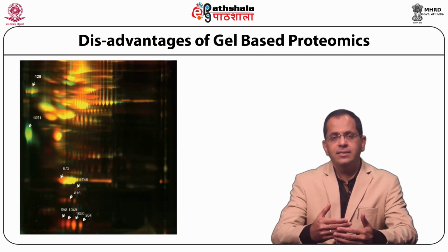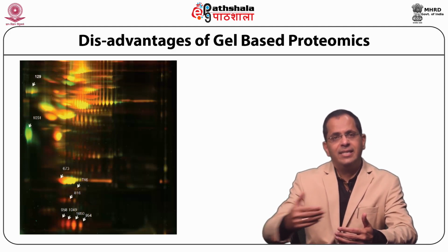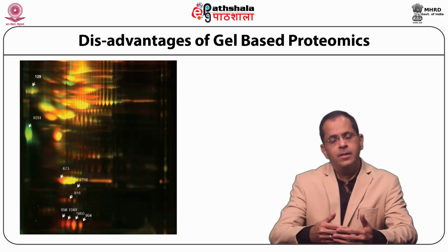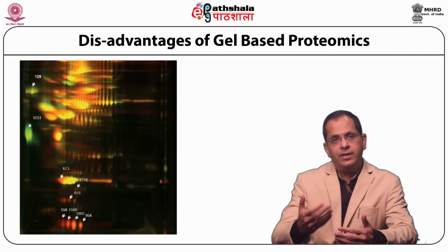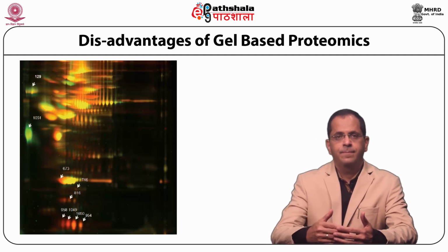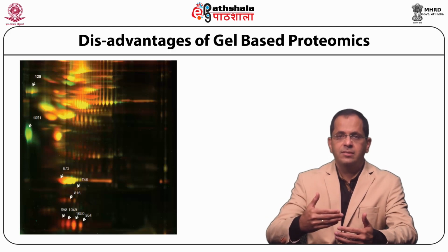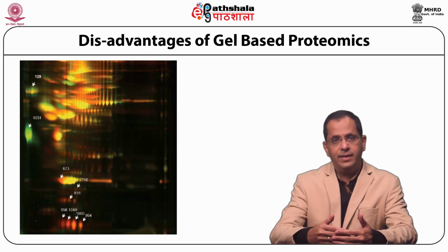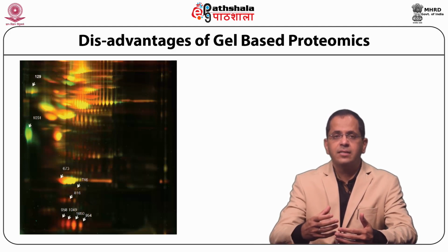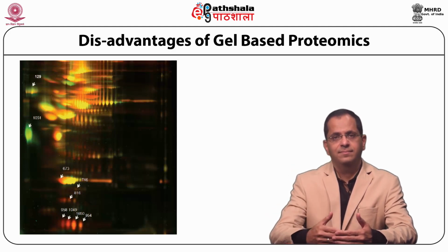There are difficulties pertaining to automation of the gel-based techniques. Co-migration of proteins in a single spot makes quantification inaccurate. Interference of non-protein substances affect gel resolution. And finally, this particular concept of gel-based proteomics is not suitable for large number of samples.